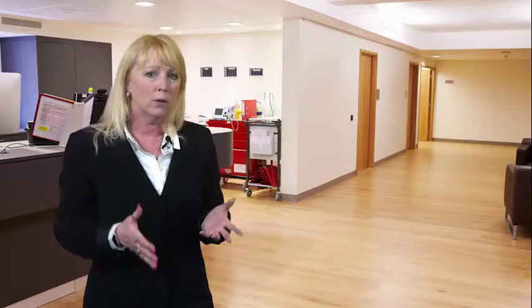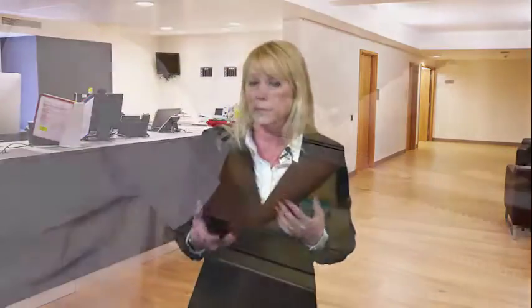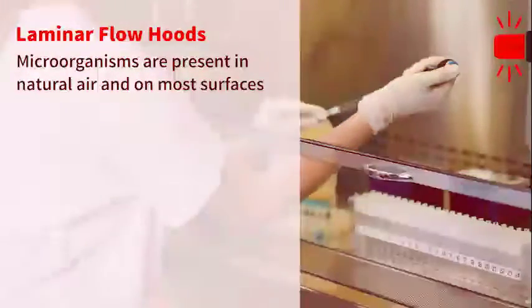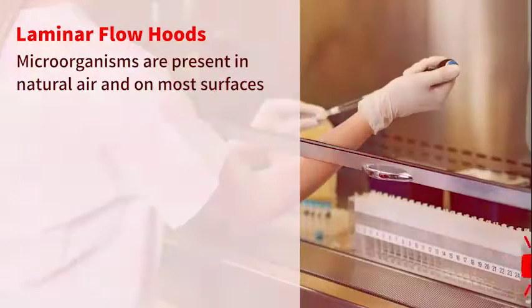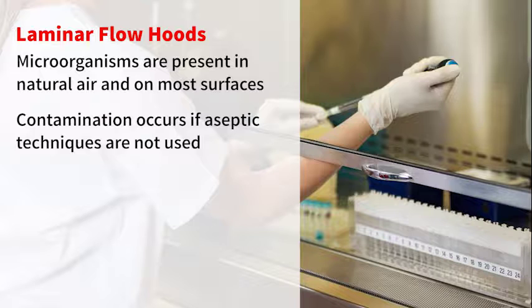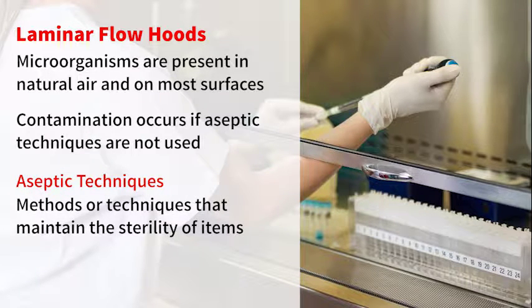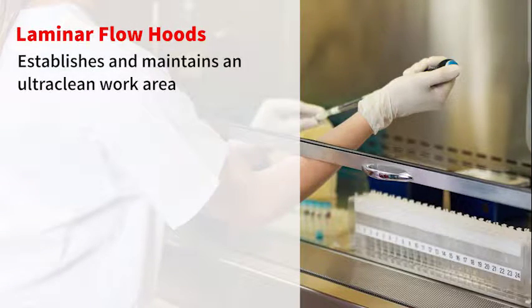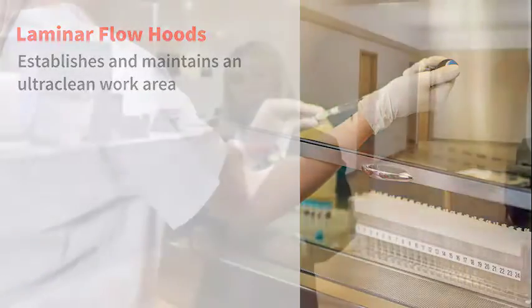Laminar flow hoods are one of the pieces of equipment that may be found in the pharmacy that you're working in. Now, laminar flow hoods are used for mixing different types of products. Microorganisms are present in dust and particle matter, in natural air, and on most surfaces. And the contamination of solutions can easily occur if aseptic techniques are not used. Aseptic techniques are methods or techniques that maintain the sterility of items. And the laminar flow hood establishes and maintains an ultra-clean work area.